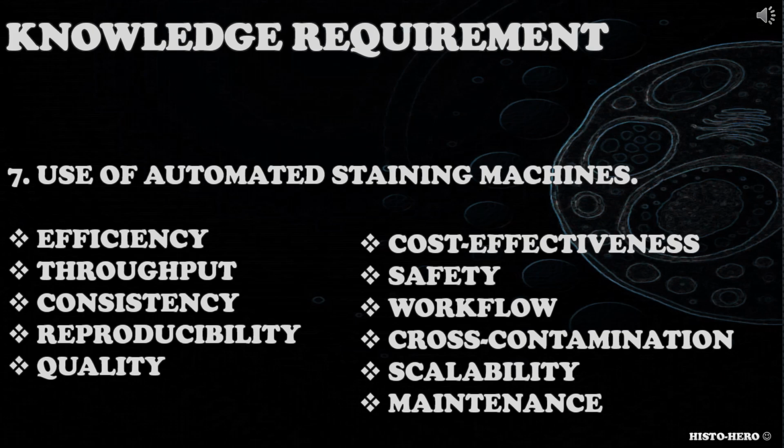When addressing this knowledge requirement, candidates should consider efficiency, throughput, consistency, reproducibility, quality, cost-effectiveness, safety, workflow, cross-contamination, scalability, maintenance, and so on.